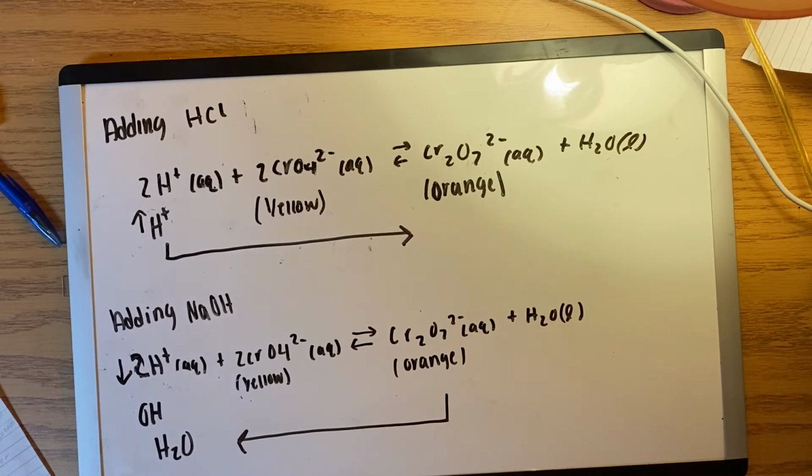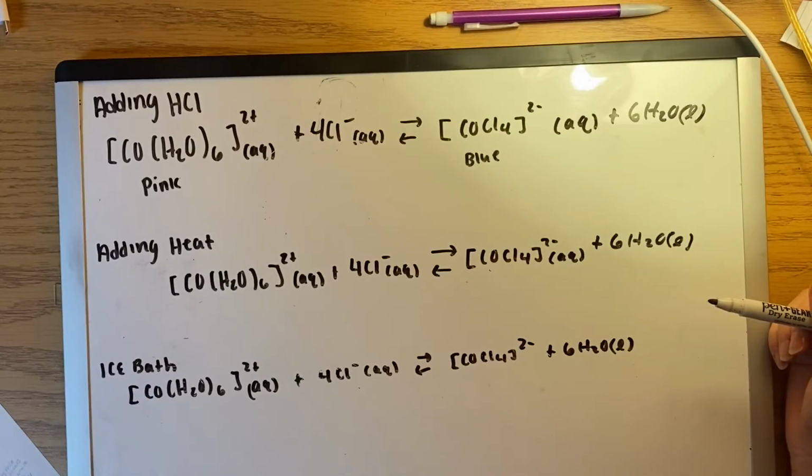This caused the color to change from a more orange color to a more yellow-orange color. The second reaction I will explain is experiment D, which was a cobalt-cobalt chloride equilibrium reaction by adding a stress of different temperatures.